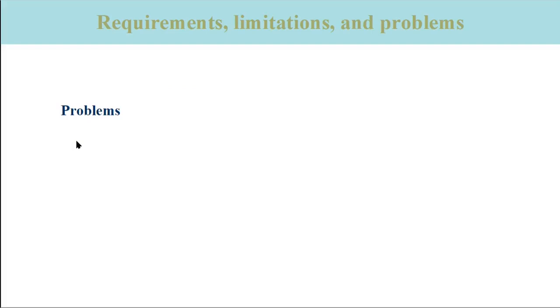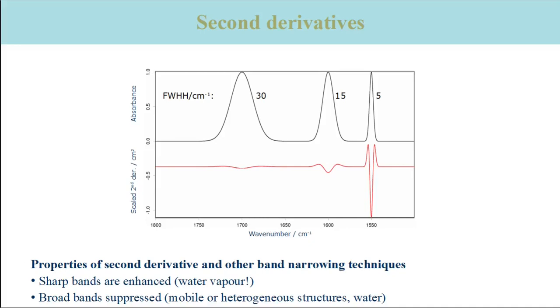Now I want to discuss a few problems associated with secondary structure analysis. We have already encountered that second derivatives are useful to identify component bands that are otherwise hard to detect in the amide-1 absorption spectrum. However, one has to be aware of a property illustrated in this slide. The black line shows a spectrum of three Gaussian lines with different widths, and the red line is the second derivative of that spectrum. While the maximum absorbance of the three Gaussian lines is the same, the amplitude of the second derivative increases significantly with decreasing bandwidths. Thus, the second derivative enhances sharp features in the spectrum and suppresses broad features.